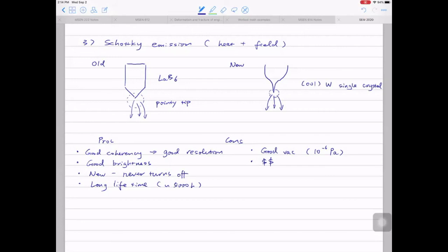That's correct. As far as I know, this is the only cold field emission gun we have at A&M. All the other instruments, such as the Helios in AgriFab and the Quanta in MIC, are regular FEGs, not cold FEGs. The Lyra and the Tescan instruments are also regular FEGs.